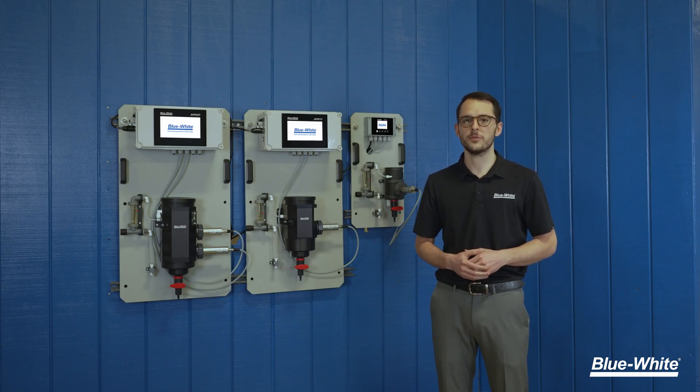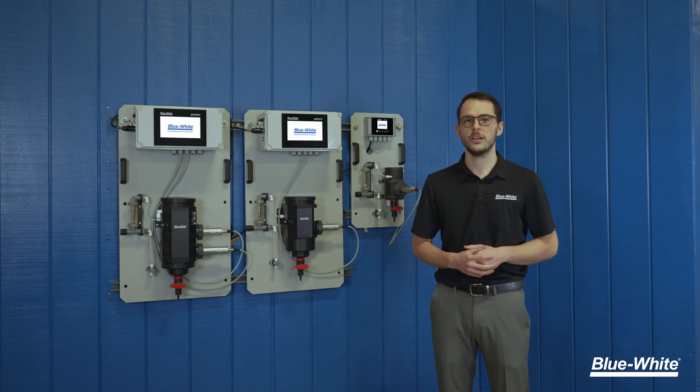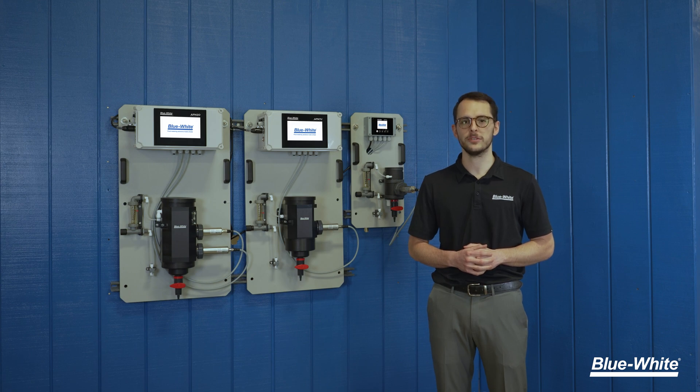Have you struggled with expensive reagents and fouling membranes in your water treatment analyzers? We understand what you're going through. Here at Blue-White, our passion is delivering new technologies to provide clean water to communities and industries all over the world.